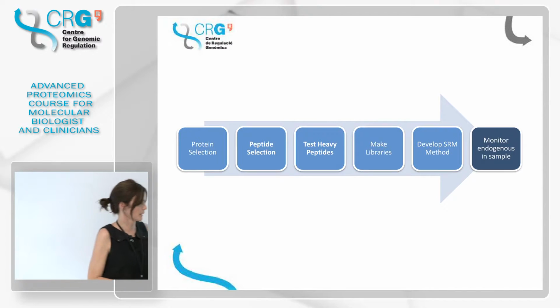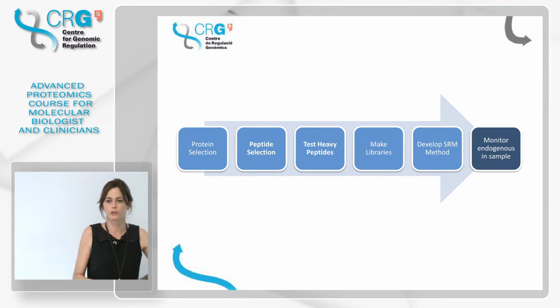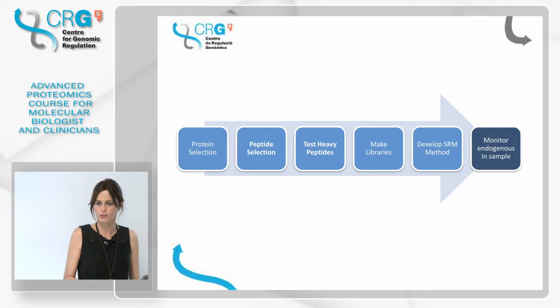Okay, so we developed the SRM method, and now we go and monitor our samples in our instrument. Everything clear?